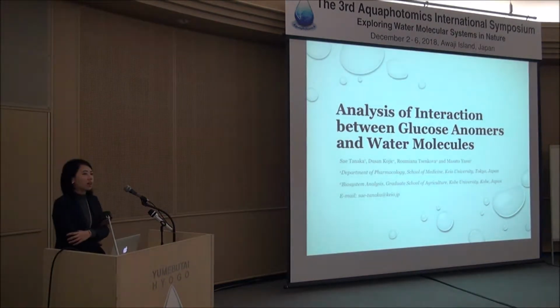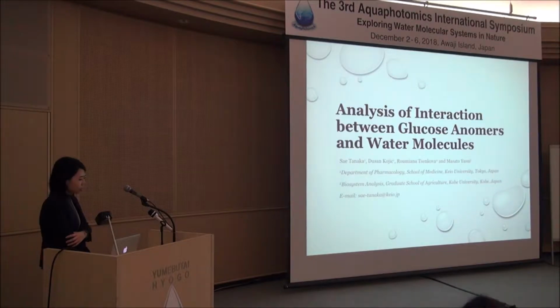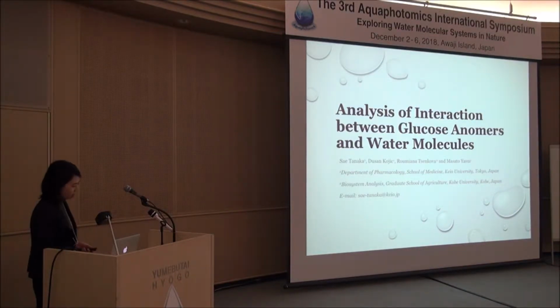Hi, good morning. I'm Sae Tanaka from Keio University. So I'd like to talk about the analysis of the glucose solution using near-infrared spectroscopy.